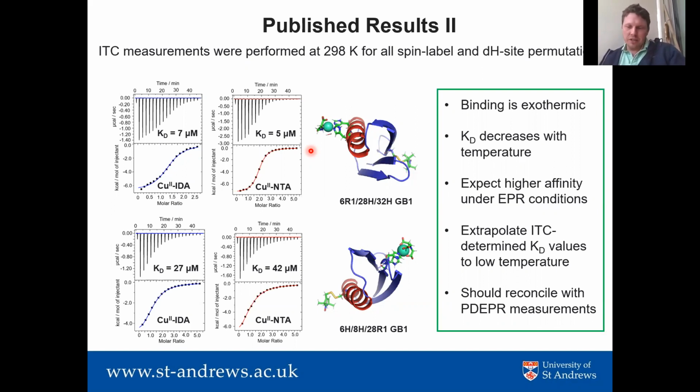Now, you hinted that you did the validation to detect some distances arising from non-specific interactions. But normally we already get a whole bunch of distances here and there, which can be due to noise and God knows what. Let's say you go through 5 different metals and you want to determine which one is the best. What's probably the best approach for that?